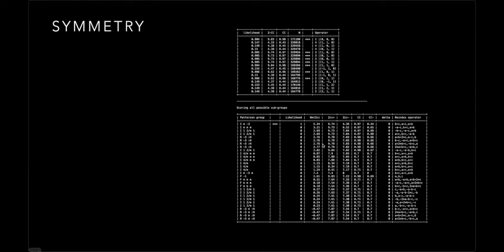If they are down to 0.3, 0.4, that symmetry operation is fairly likely to be absent. And then it takes that list of operations and composes that to figure out the correct space group. And this is surprisingly robust.